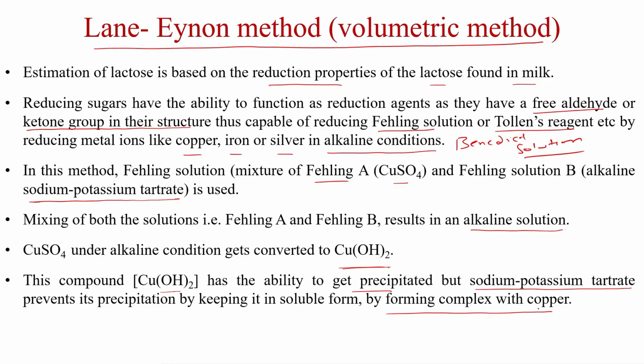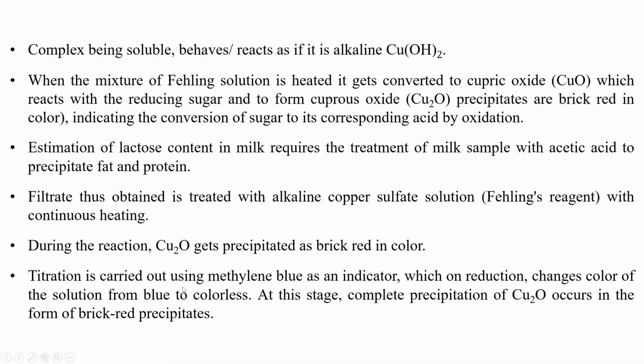So the complex, being soluble, behaves as if it is soluble alkaline cupric hydroxide.